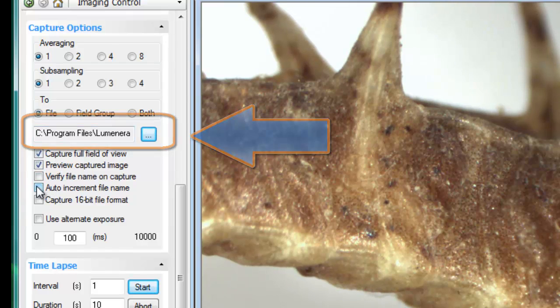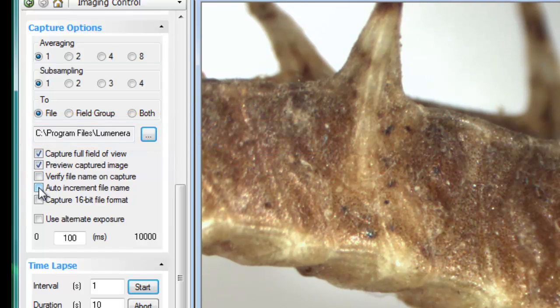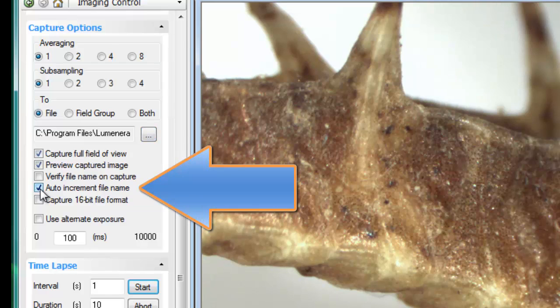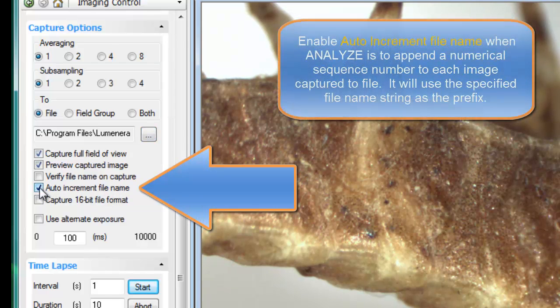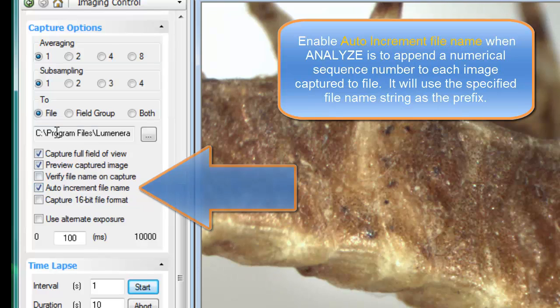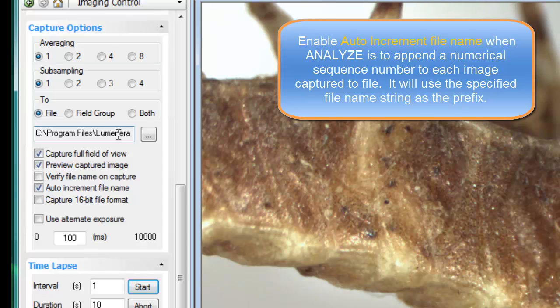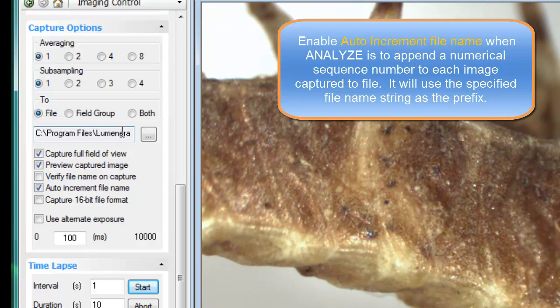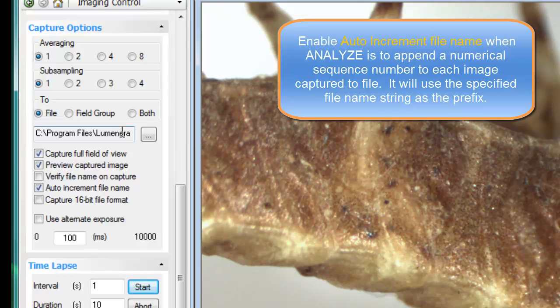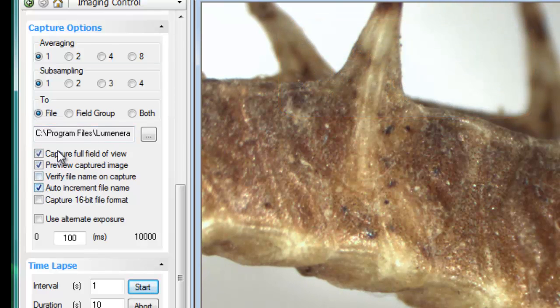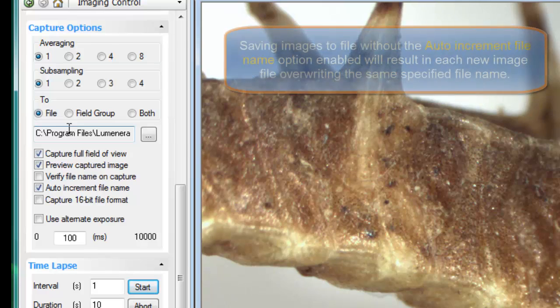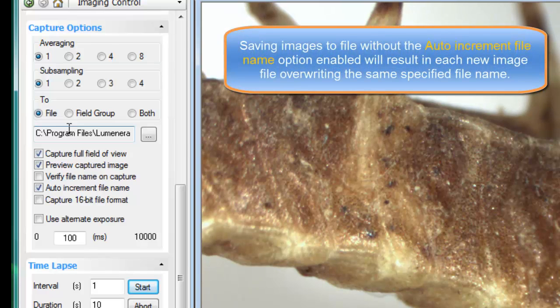I'm going to jump ahead now to specify what happens if you use the auto-increment file name. So by enabling auto-increment file name, each image that you capture will have a numerical value appended to the root file name or prefix file name that you specified up above. If you do not specify to auto-increment file name, then each time you click the capture button, the same file name will be overwritten.